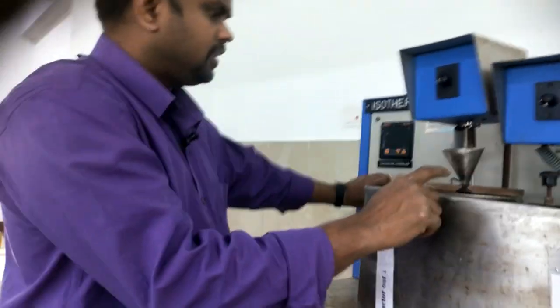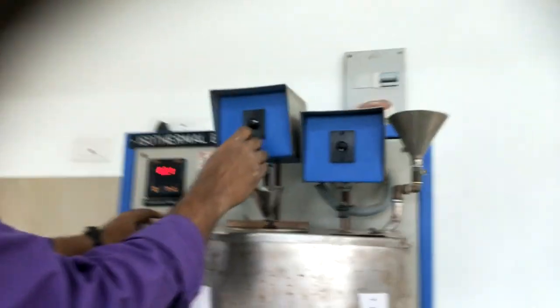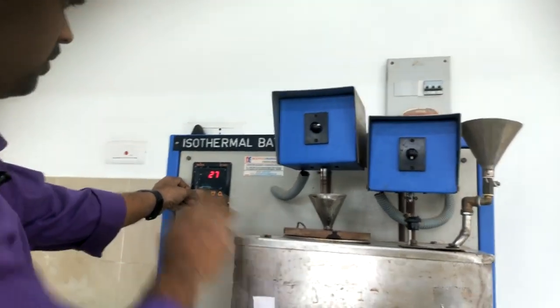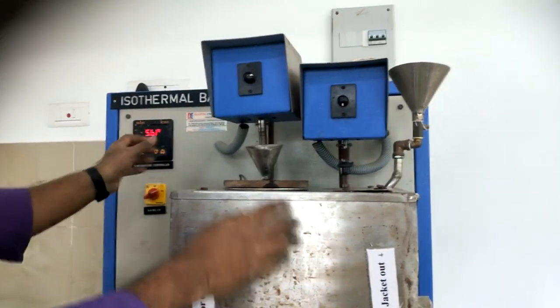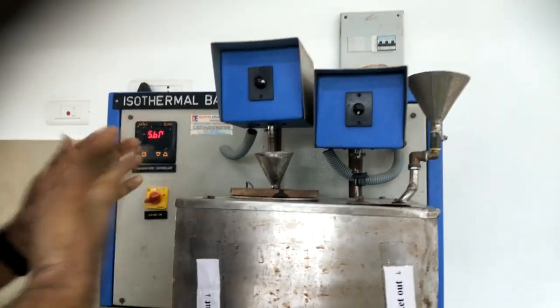The moment we added this into the system, we switch on the agitator. Isothermal condition is maintained in the system, 25 degrees Celsius, room temperature, and we are maintaining this RPM, the agitator is rotating. So the reaction has started.